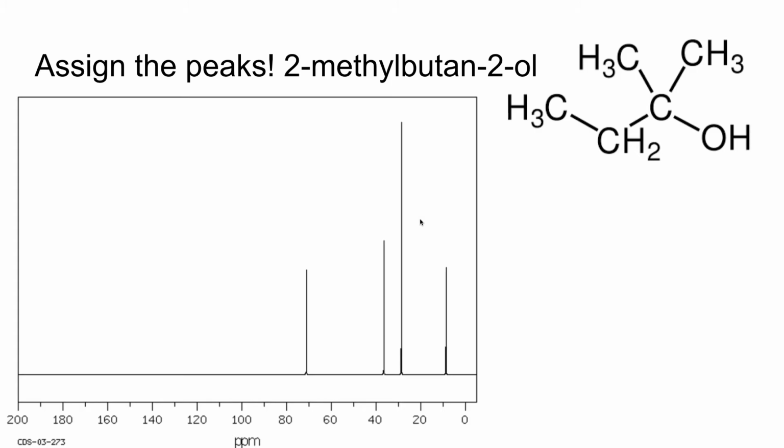Oh, maybe somebody else can help us answer this. That's a really good question. I put CH2 for that one because I thought... And that's good intuition because you saw the higher peak, which means more carbons in that same environment. But why is that CH2 carbon more downfield than those CH3s? That's your question. Come back to that, Ben.